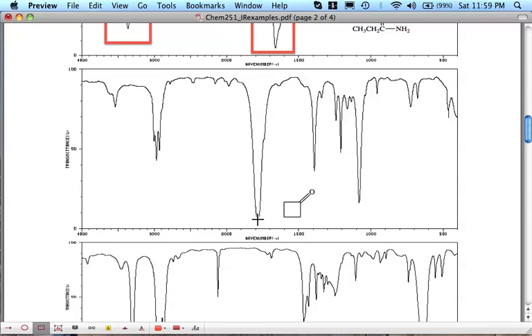And the anhydrides can also come this high, but then usually you have two different peaks instead of one. Just one other thing that I'd like you to characterize if you're doing this is right here. What are those guys again? Yep, our sp3 CHs. So again, we have sp3 CHs not shown on this line drawing, and we're seeing their vibrations right there.